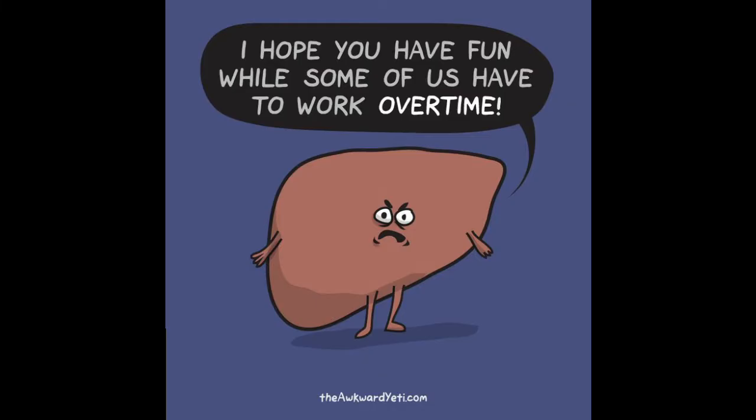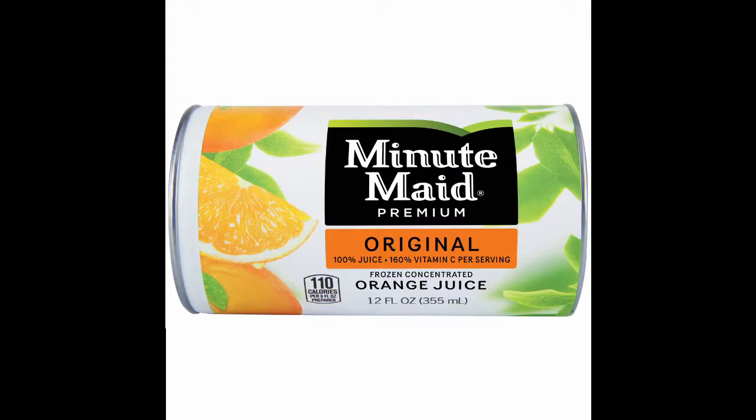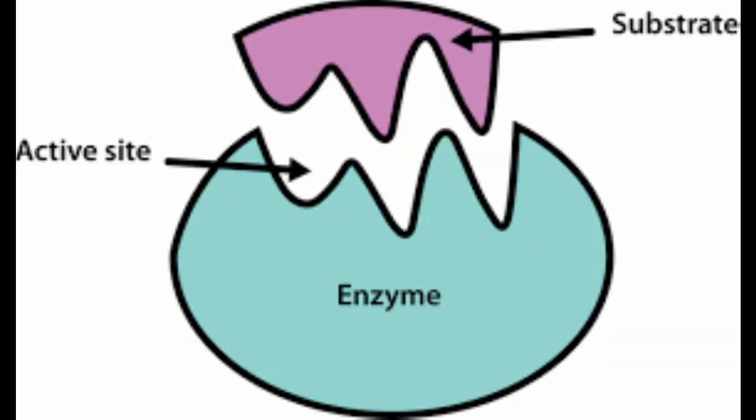Catalase is found in the liver, where it breaks down hydrogen peroxide, a cytotoxic agent, into water and oxygen. It is believed that a 0% concentration will result in no activity, and as the hydrogen peroxide concentration increased, so would the rate of reaction, leading to a greater volume of oxygen gas produced. With the higher concentrations of substrate, the enzyme would have a higher chance of binding and also have more to bind to, hence be able to release more products.